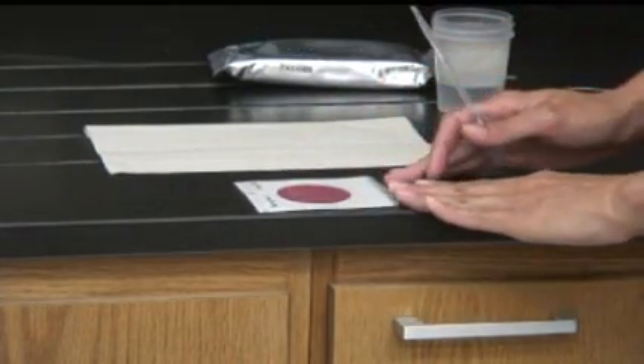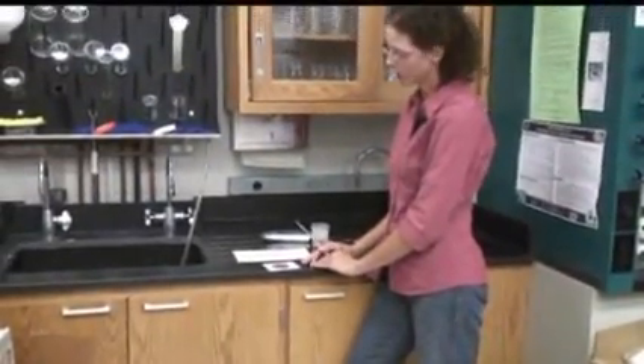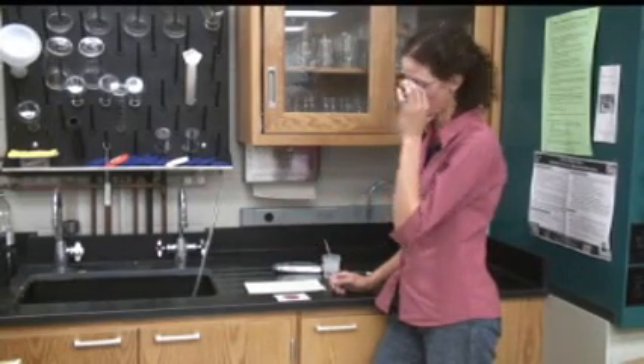Then allow it to lay flat for approximately two minutes, and the agar will solidify or gel up. After that, you can stack the samples or move them around. They're okay to tip from side to side. You don't want to tip them right now because your water sample would run off of the plate.